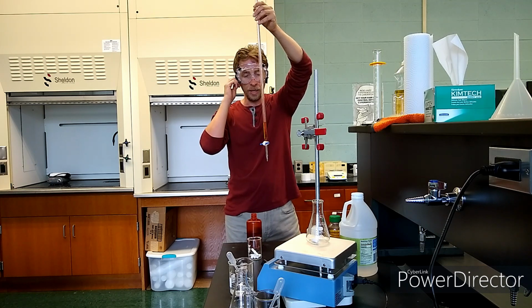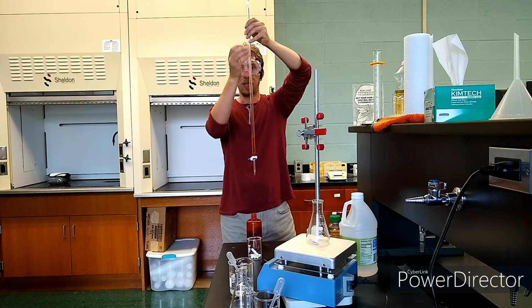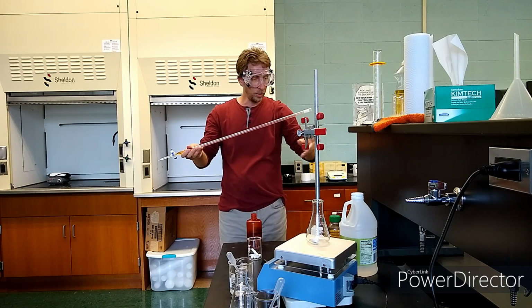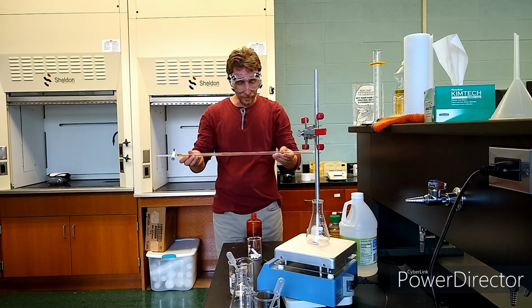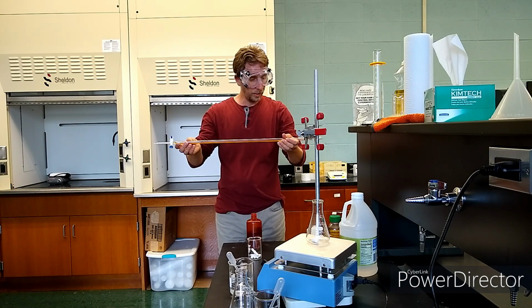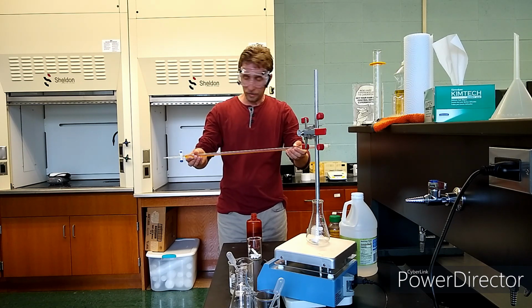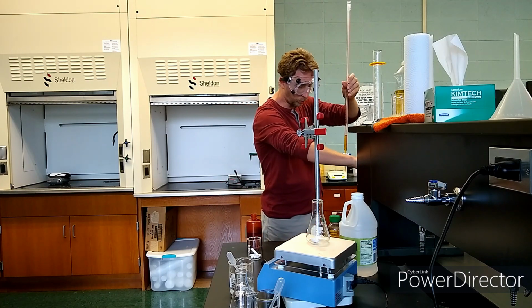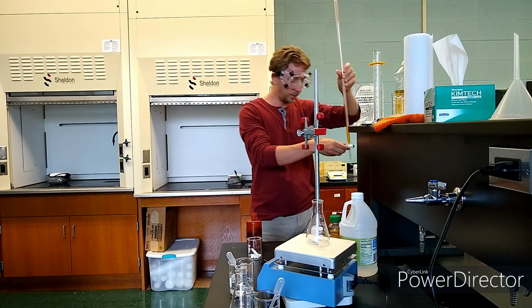So we don't want that, and to get rid of that, you can rinse the inside of the burette with the solution that you're going to use. So I like to go ahead and turn it horizontal and hold that over the sink. Without draining it, though, I can watch the liquid go down and turn it in my fingers here to rinse out any water droplets and contaminants on the inner walls of the burette and not spill it at the same time. So that seems like a pretty good rinse. And I'm just going to turn the water on here and drain the iodine down the sink.